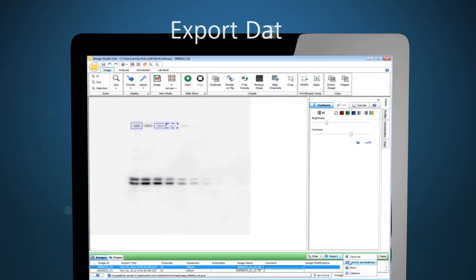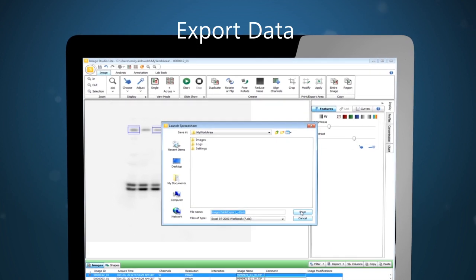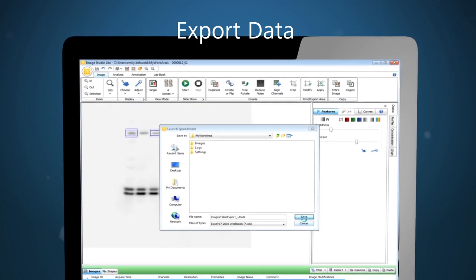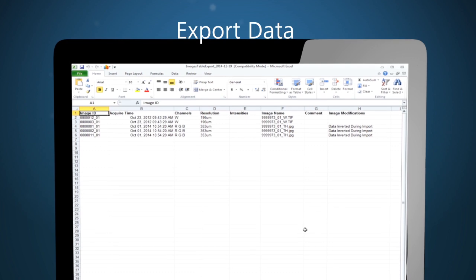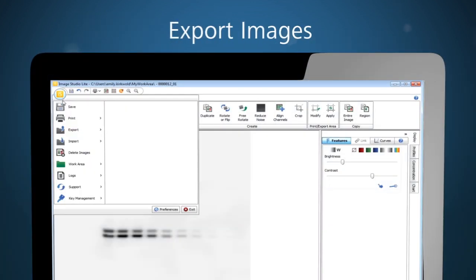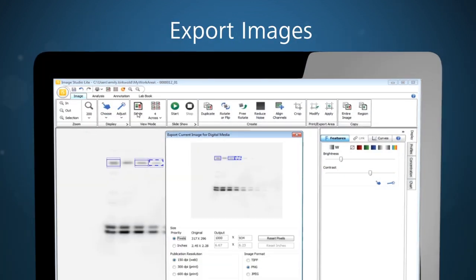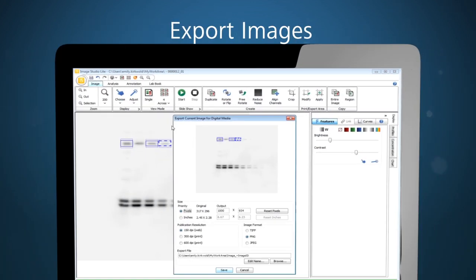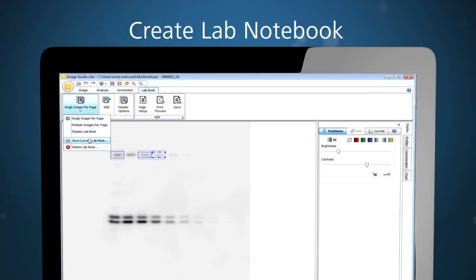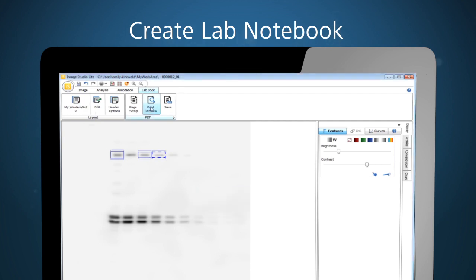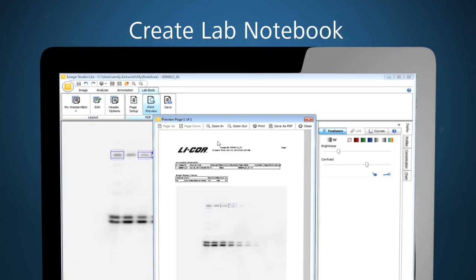You'll appreciate the simplicity of managing all of your data and images from start to finish. Export the information you need for presentations or publications quickly and easily. Finally, create a lab notebook within the software to submit to your colleagues.